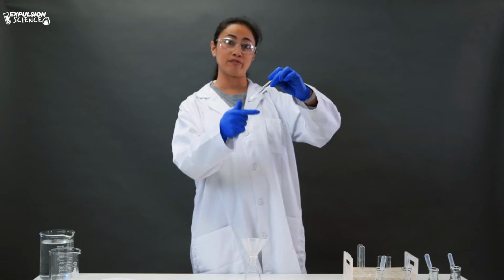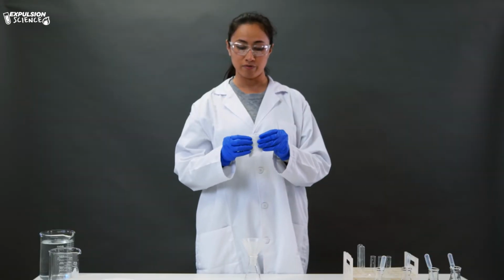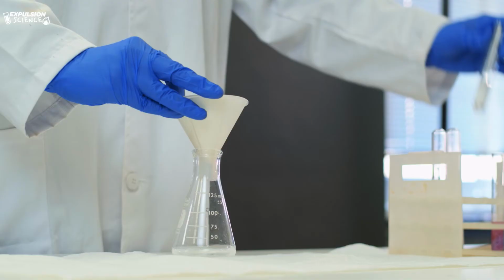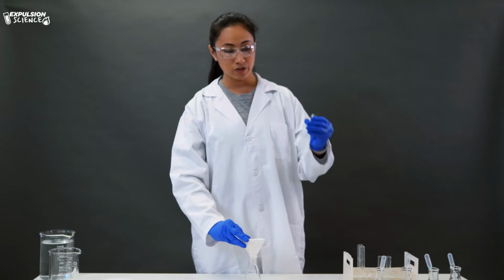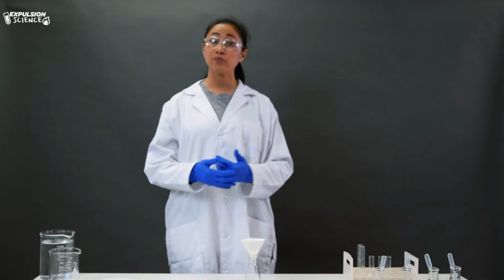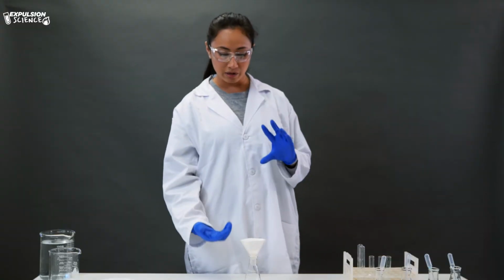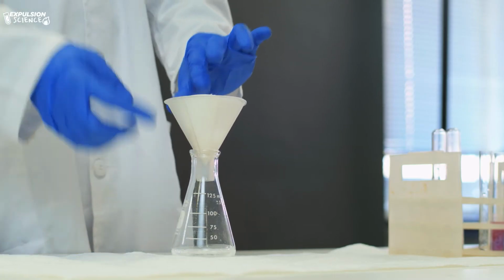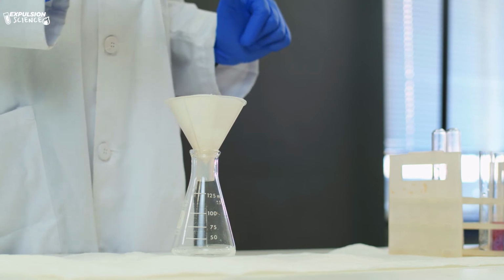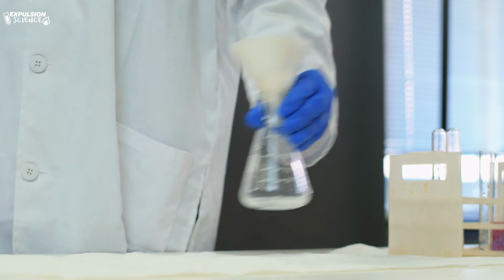To take this a step further and to allow us to see what the substance will look like when it's separated from the mixture, obtain filter paper. We're going to fold this filter paper into fourths, open it up into a cone, and allow it to sit right above our funnel. I'm going to pour this entire mixture through my filter paper, and then we wait. We're basically allowing the liquid in this mixture to be filtered out as the filtrate, and then we will see that precipitate left behind on our filter paper.